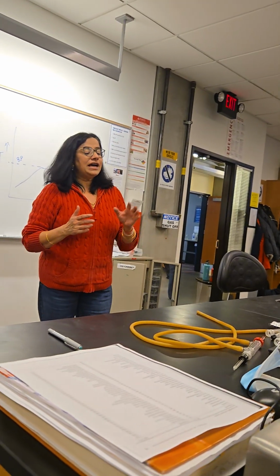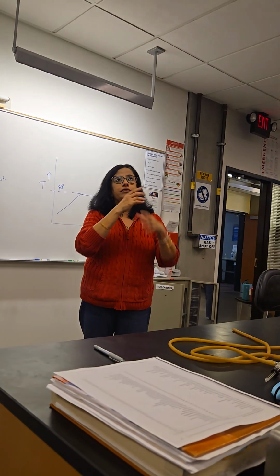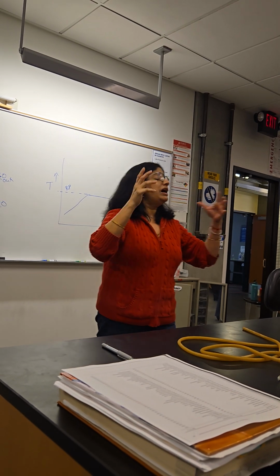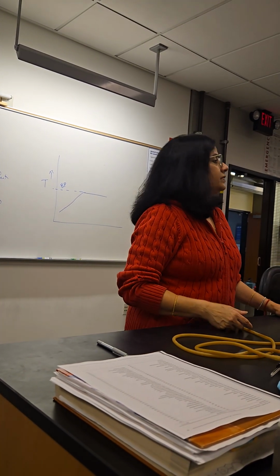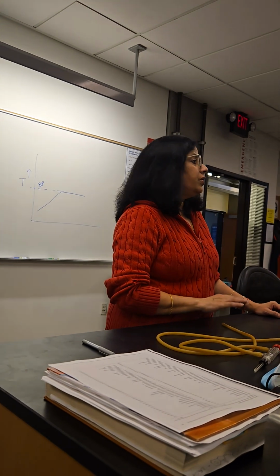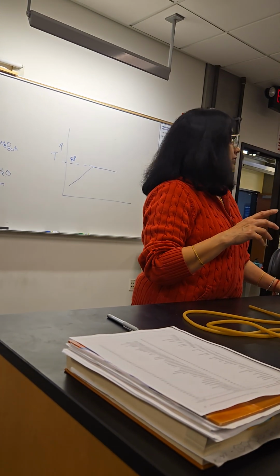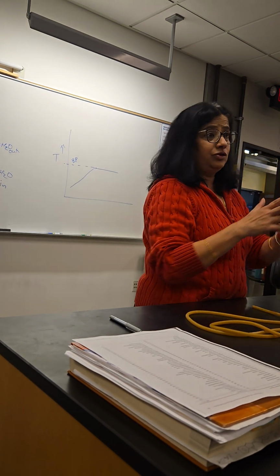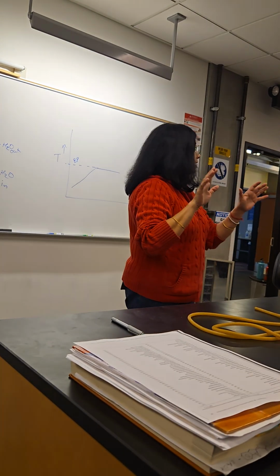Okay. As far as IR is concerned, I think the best way for us to work with the IR would be when you have your distillate ready and you're ready to do IR. Then you tell me, and I will walk with you so that we can do the IR together. Assuming you watch the video, so you drive it, but I'll be there to make sure everything is going.